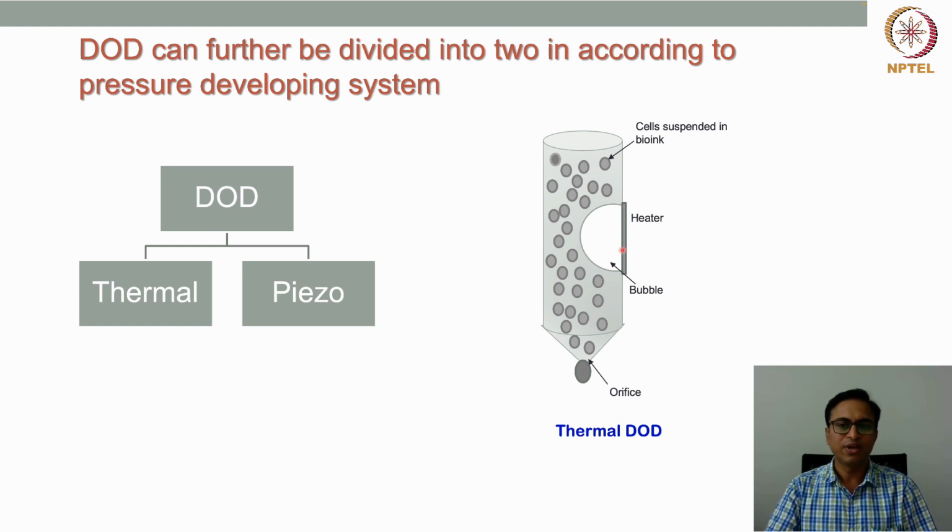Now, whenever this heater is heated up, what happens? A bubble will be produced, because the heater is heating up the liquid material present within the nozzle.